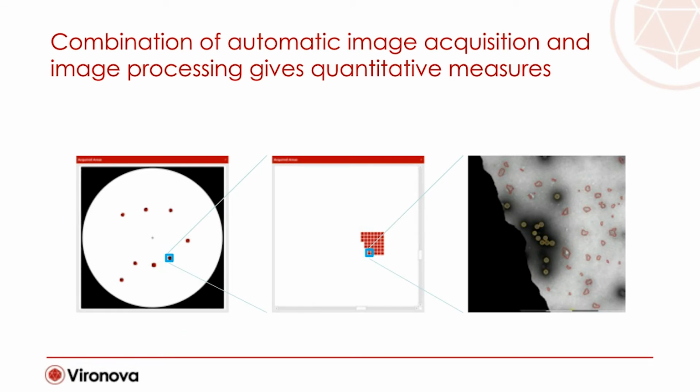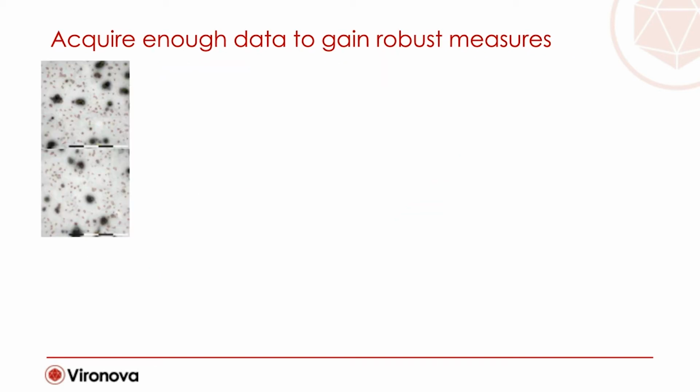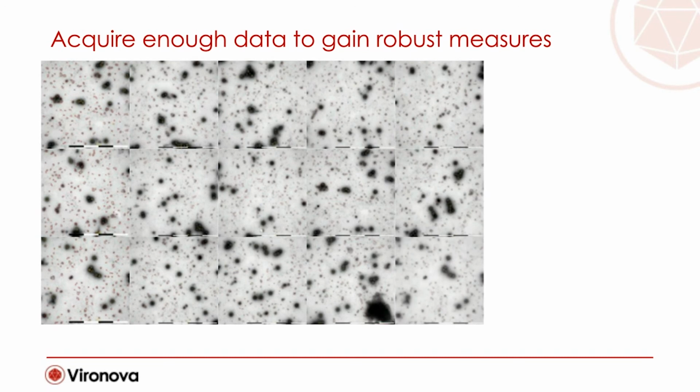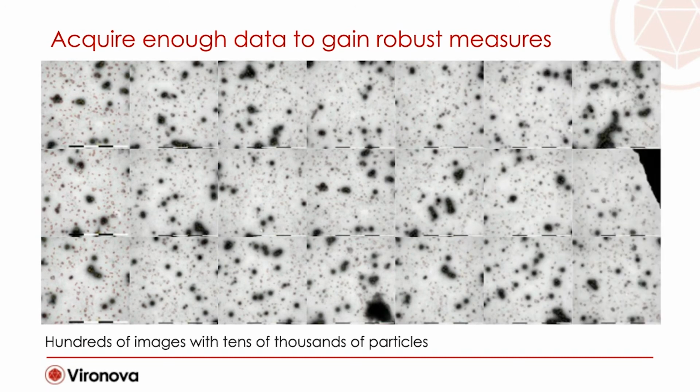So the system moves from area to area and collects images at each area based on user configuration. Each image is processed and particulate matter such as the primary analyte, but also undefined structures of interest are registered and accounted for. This is done for hundreds of images with tens of thousands of particles available for statistical analysis. For biological samples, with its diversity and complexity, the automated operation takes about an hour. Easier samples take, of course, shorter time to process until convergence of statistical parameter estimations.